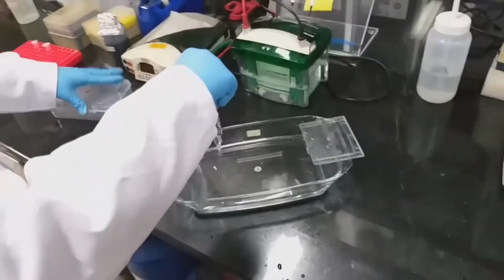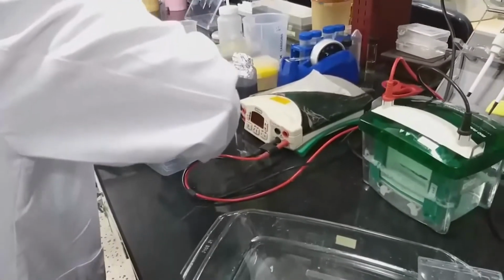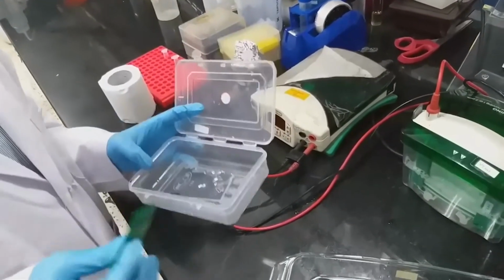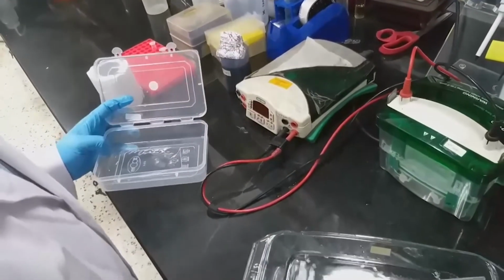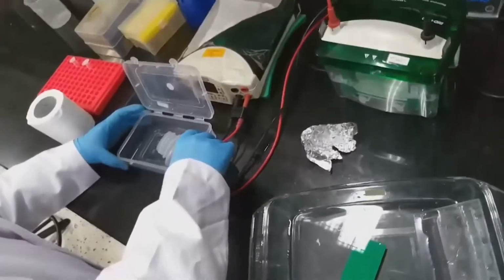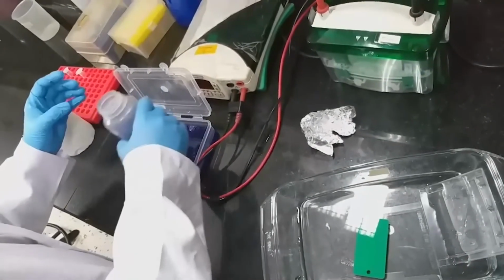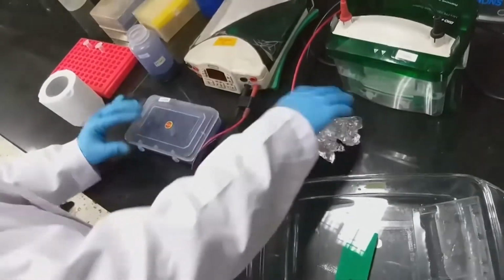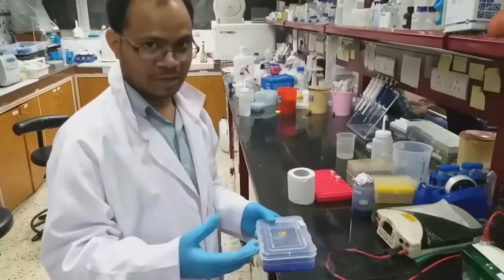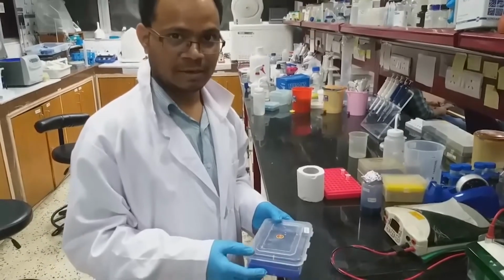So keep the gel in a staining box, which is more or less a plastic one. Then I am going to add staining solution. I will keep it for rotation on a shaker for at least 2 hours, then we will de-stain.